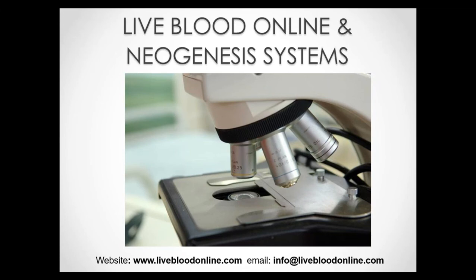So the blood elements can be seen in their living state, very much as the live blood actually is in the system. The practitioner and the client look at the variations in the size, the shape, the ratio, and the structure of the red blood cells, white blood cells, the platelets, and the other blood structures, as well as the plasma, which is what the red blood cells are floating or suspended in. So the insights gained from live blood analysis, correlated with other clinical data, enable the analyst to understand his or her client's individual state of health on a much deeper level.